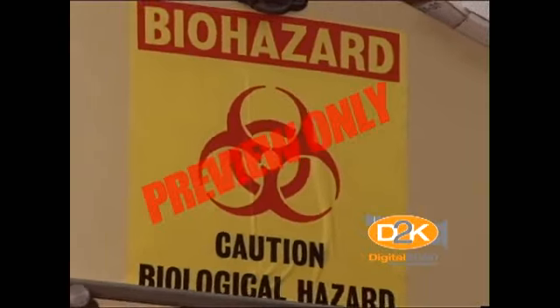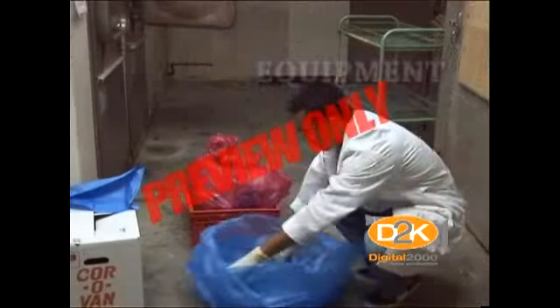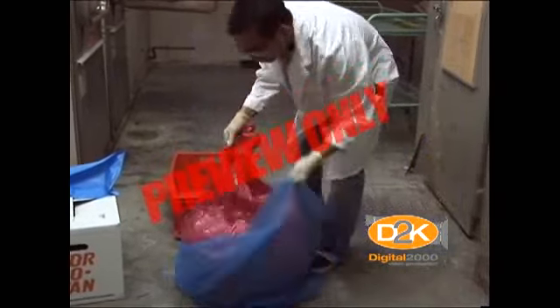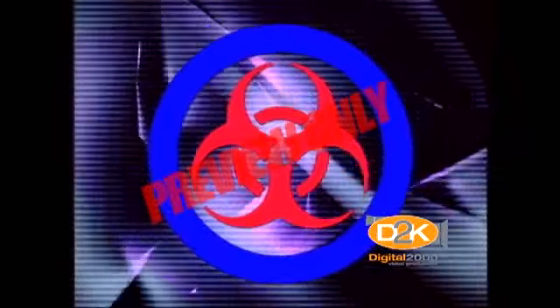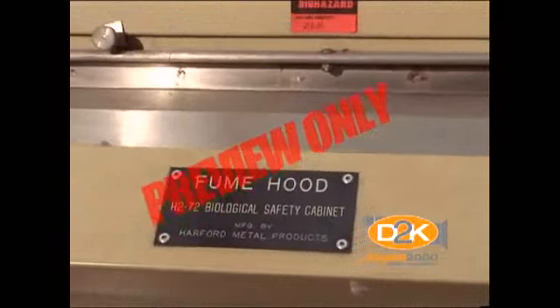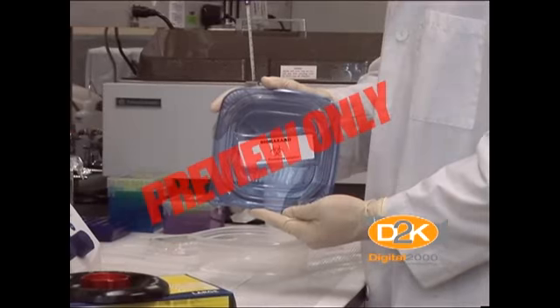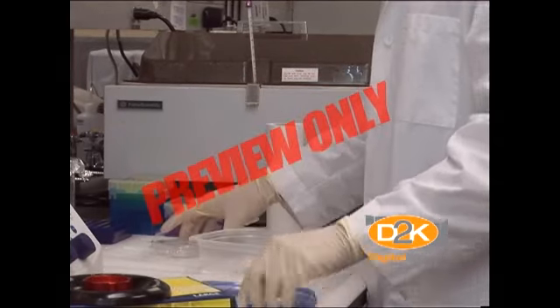The biohazard warning label shall be used to signify the actual or potential presence of a biohazard and to identify equipment, containers, rooms, materials, experimental animals, or a combination of these which contain or are contaminated with viable hazardous agents. The standard does not specifically mandate colors to be used on biological hazard tags. OSHA recommends fluorescent orange, orange-red, or a similar color with the lettering biological hazard in a contrasting color. Clearly mark all containers for biological materials as to their content and the word biohazard.